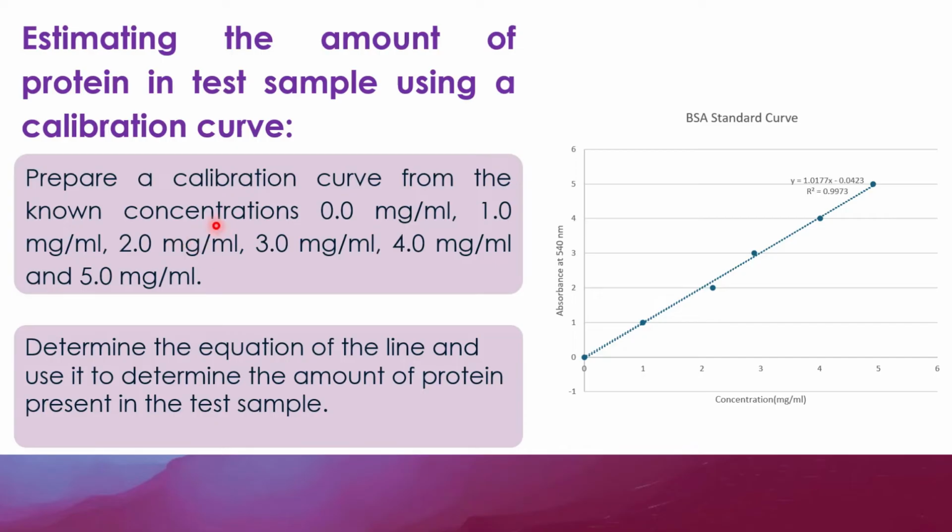After preparing these concentrations from our stock BSA solution, we subject each of these concentrations to the Biuret test method.